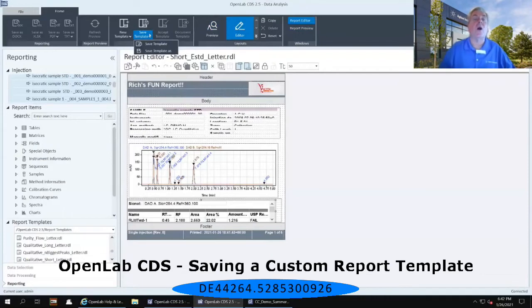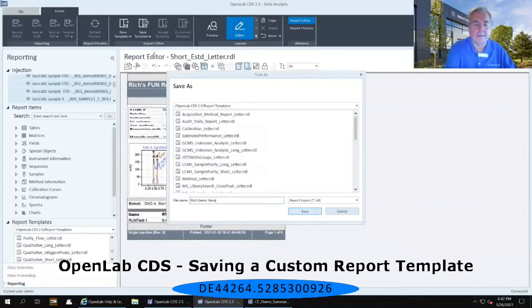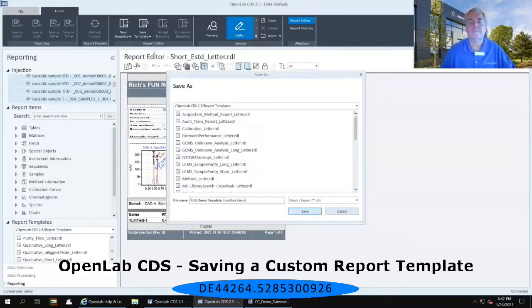So I always suggest selecting the second option to Save the Template As and give it a name — for example, Rich Demo Template Injection Report — and then select Save.